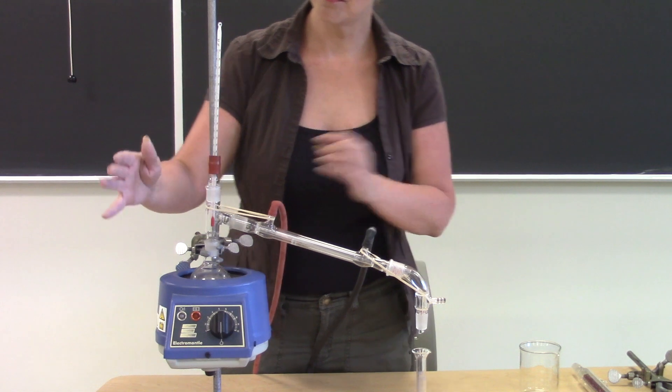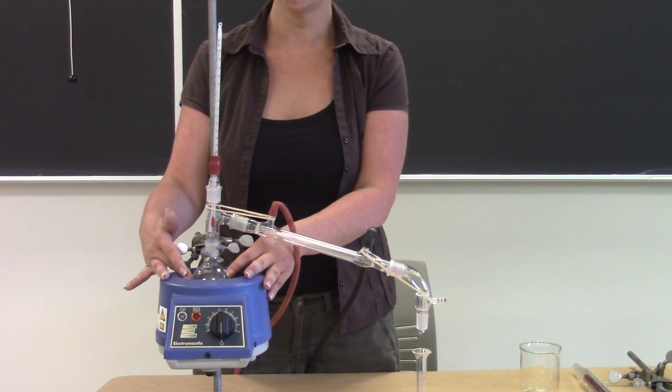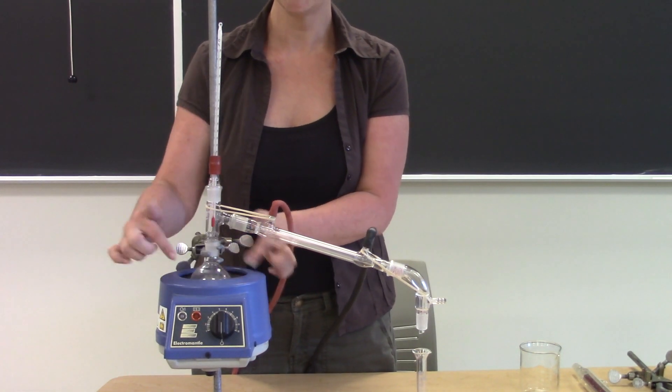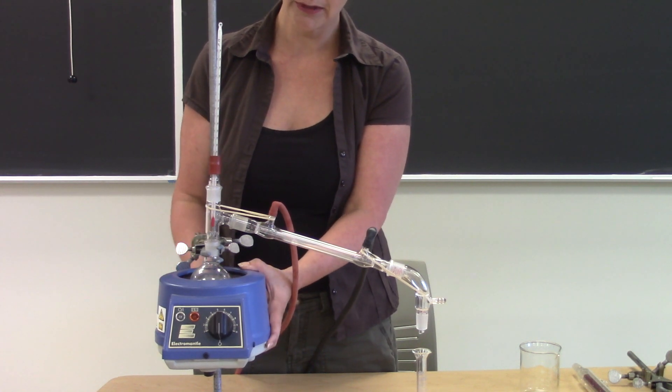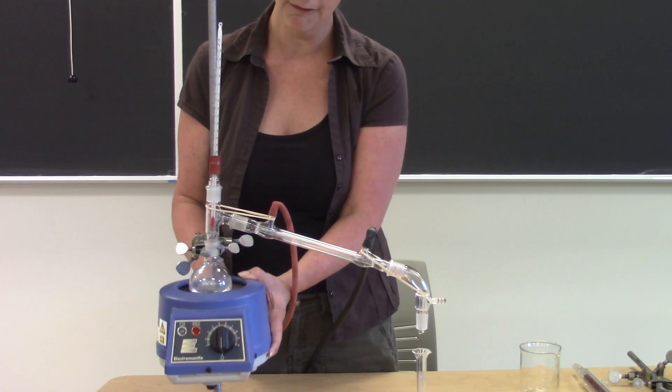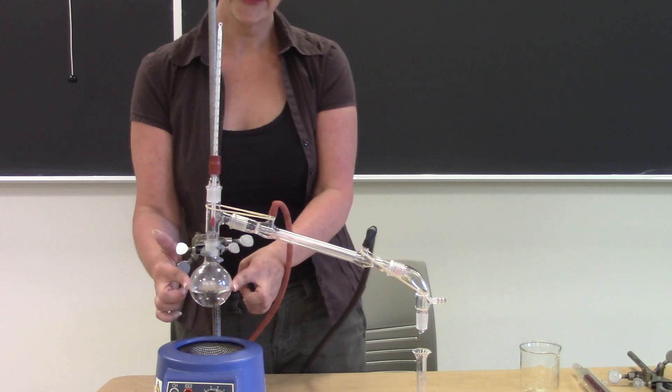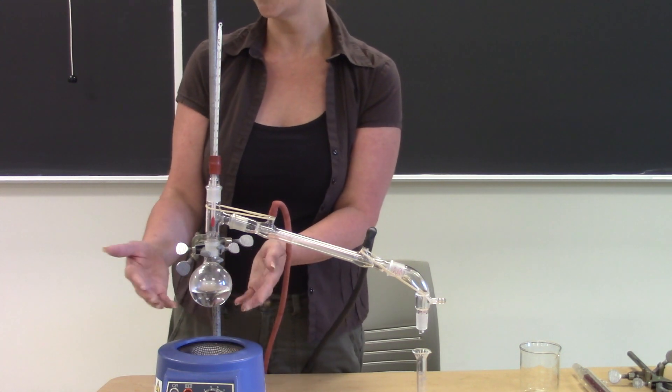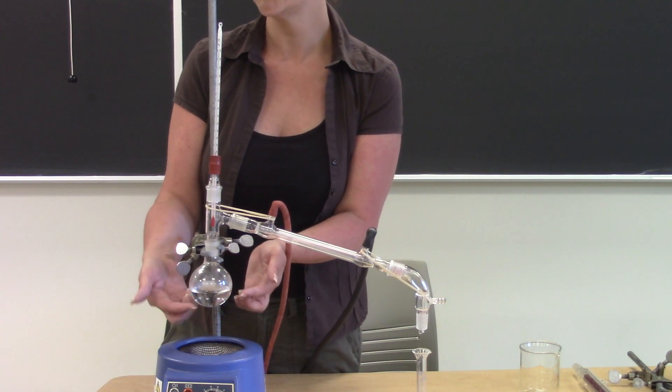So the flask that you're going to be distilling from is inside this big heating mantle. So I'm just going to lower that down so that you can see the flask. I have a flask here that, just for this demonstration, has some water in it with some boiling chips.